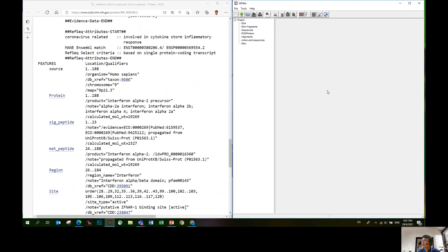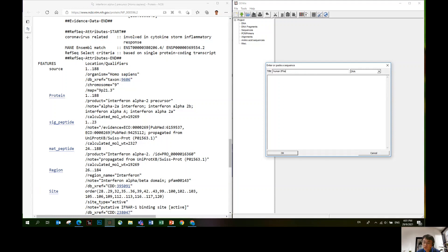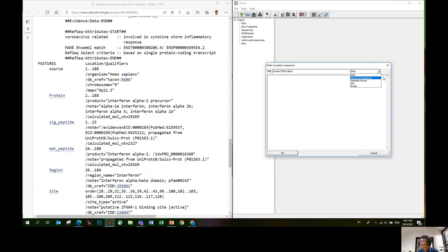Once you have the sequence here, you can go back to the Gento window, click enter. I'll give it a name, human interferon alpha-2 demo. This category of molecules you have to choose amino acid because the default sequence is DNA.